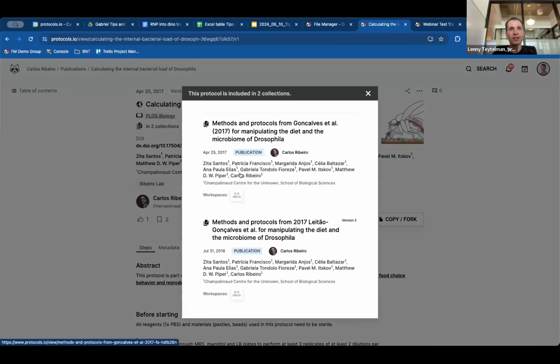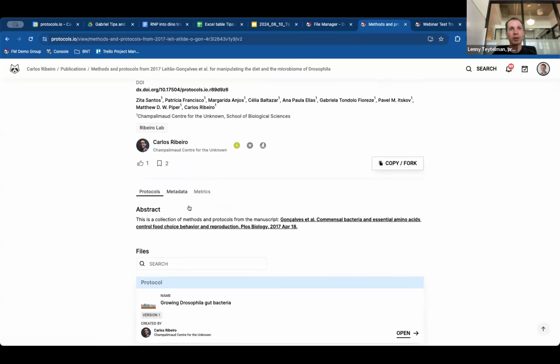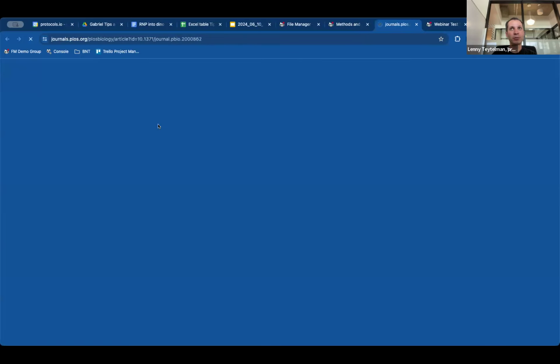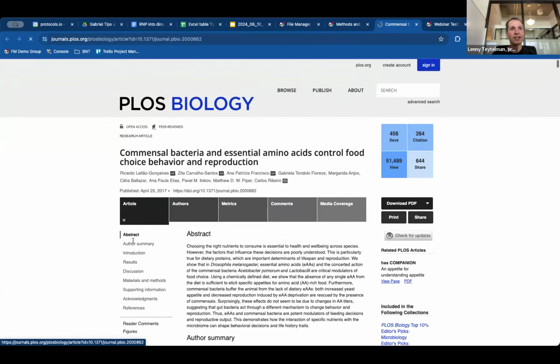I can click on this, and if you navigate to the collection, this is a public collection. It's part of a paper that was published in PLOS Biology. And it's a great example.